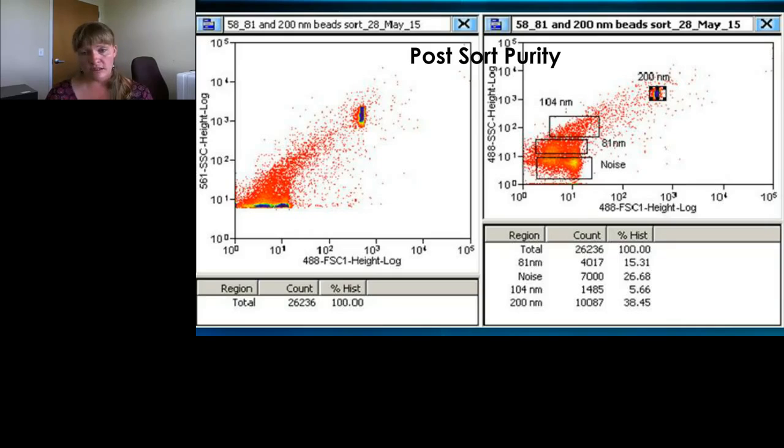Generally, when you run purity, you hide the noise, and you can't do that. So we're going to need an additional analysis package due to the nearness of that population to the noise. These sort outputs were then analyzed by dynamic light scatter on the Delsa Max.